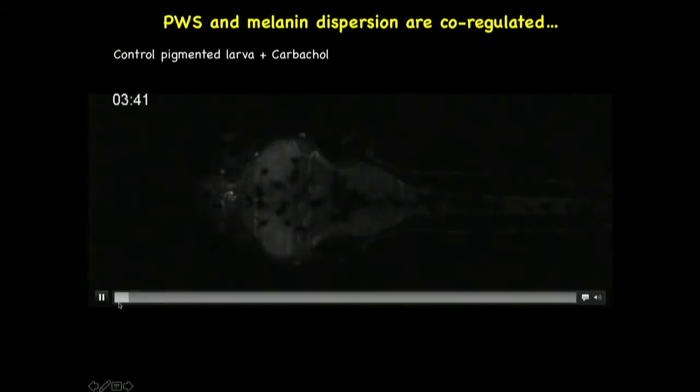And we had another finding in parallel to this. I don't know if you can see this very well, but using a zebrafish line that still had pigmentation, we found that... I'm going to play it faster. Here you will see the midline activation just before the propagation from the pons. And you will see that the pigmentation will change. First, those melanocytes are serrated, and as the wave propagates, they will get rounder. Then, once the wave has propagated, the melanocytes become serrated again, so those dark pigments just spread out.